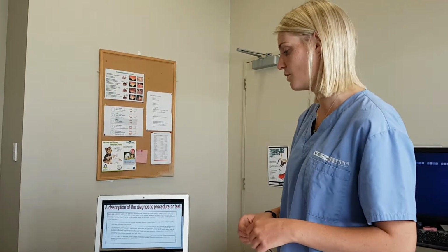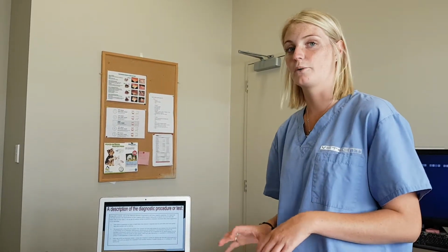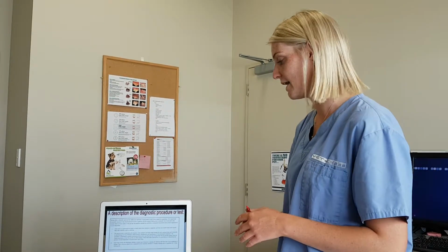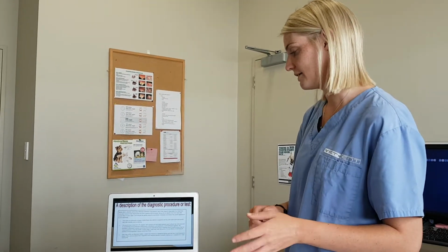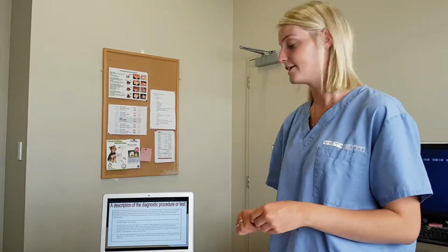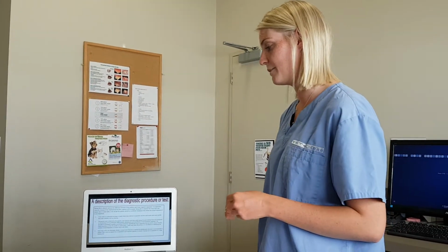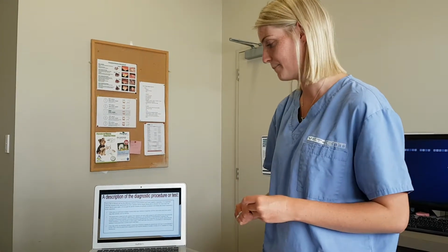So gram stains are performed on many things: biopsies, bodily fluids like from ears and nose, snot, things like that, wounds. They want to look at the suspected infection, and from this they yield results much more quickly than methods like cultures.